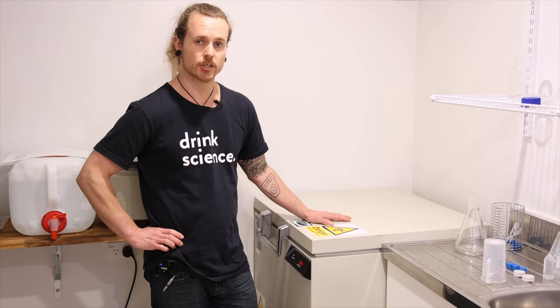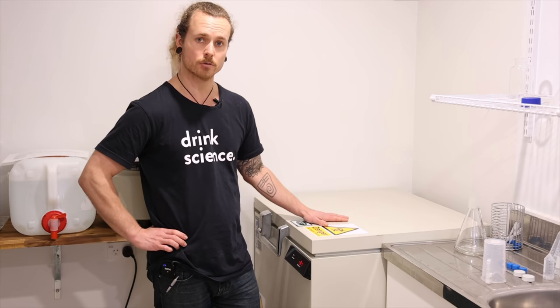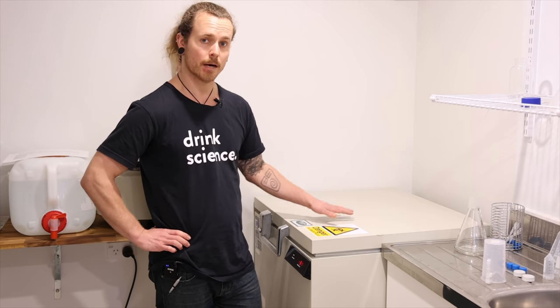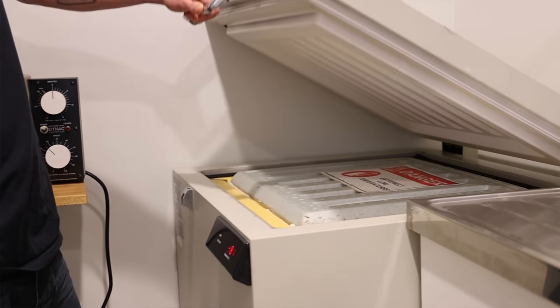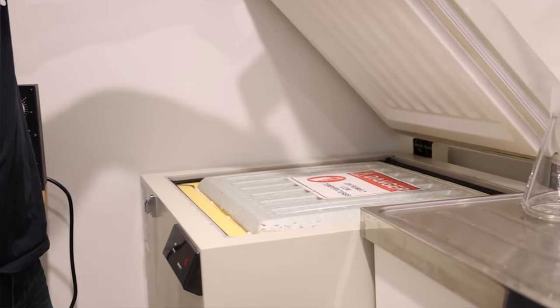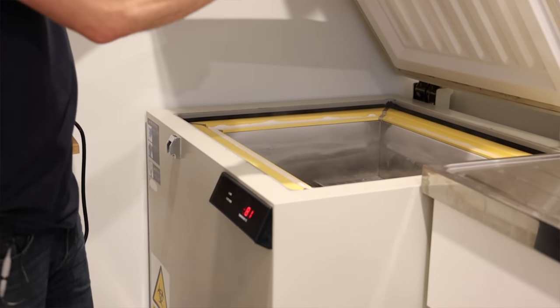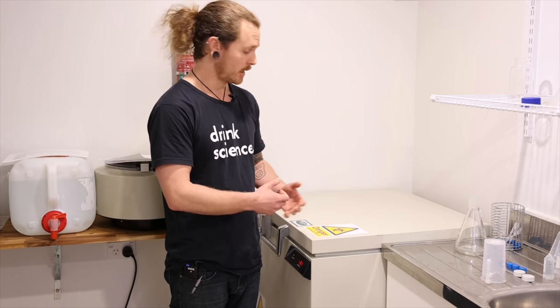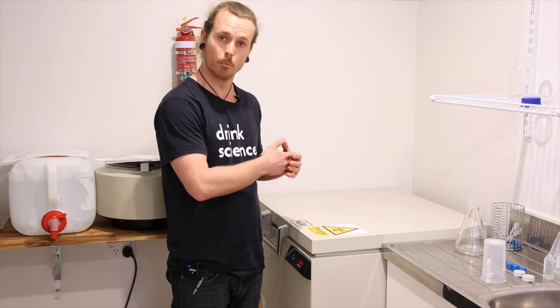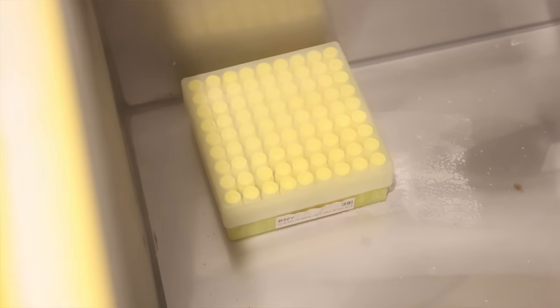So this is essentially our yeast bank. This is where we have all our mother cultures frozen at minus 80 degrees. At those ultra-low temperatures, we will basically prevent any mutation or genetic drift, and we can be very confident that the yeast we draw out of this is the same as it was when it went in. It effectively works as the starting point for all of our propagations, and it ensures that we're working with a clean and consistent stock of the strains that we offer.